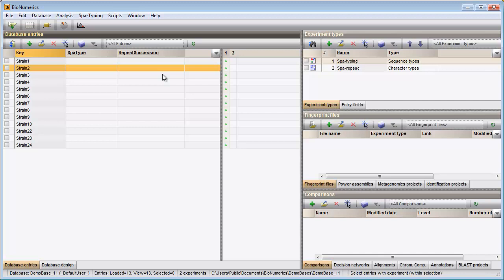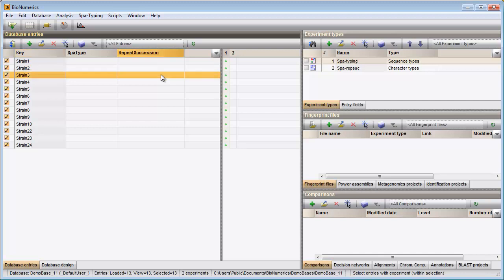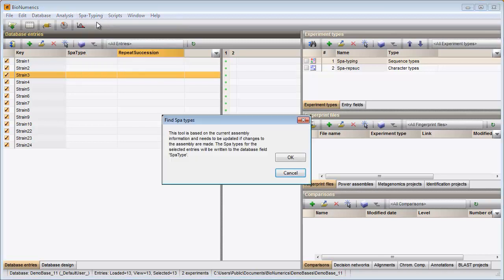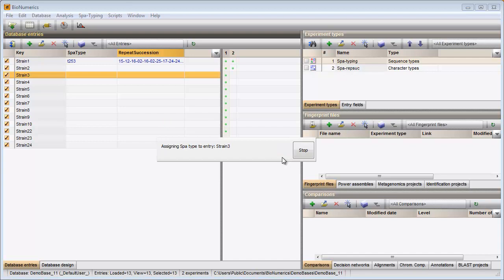I will select all entries in my database using the keyboard shortcut Ctrl-A. I then select Spa-Typing, Assign Spa Types. Pressing OK starts the identification for my selected entries.